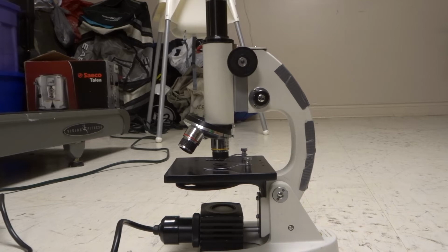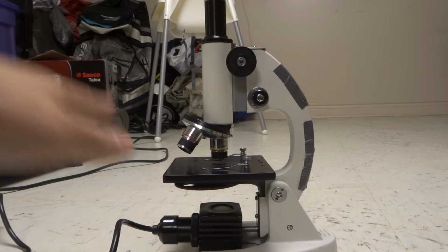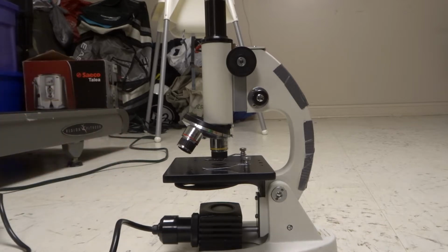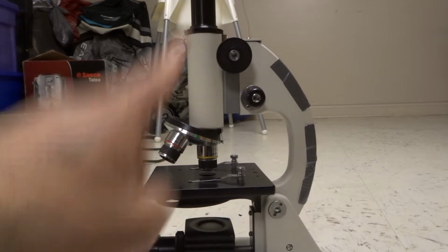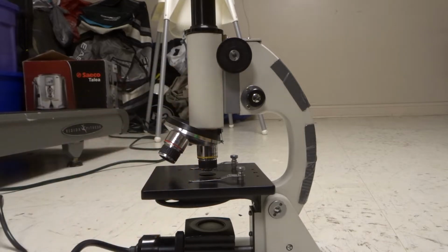Everybody, I'm here today to show you and tell you how to calculate magnification on a microscope. This will be a full tutorial for absolute beginners with easy instructions, so let's get right into this video. As I said before, if you want to calculate the magnification on a microscope, it's pretty easy to do. Now there are essentially at least one level of magnification and potentially two, but most likely there will be two.